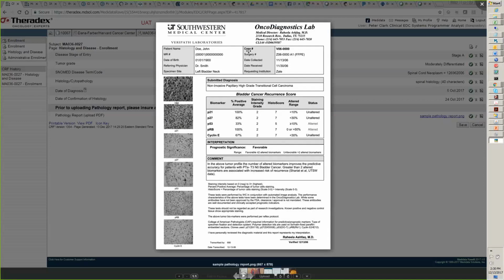And so here's a sample report. And we've specified in the form instructions that you might be able to see behind this image of the report that all private patient data identifiers would be removed. So there'd be a redaction. You'd see a black magic marker through various critical things like the patient's name, for instance, and any medical record number from the hospital that identifies them.